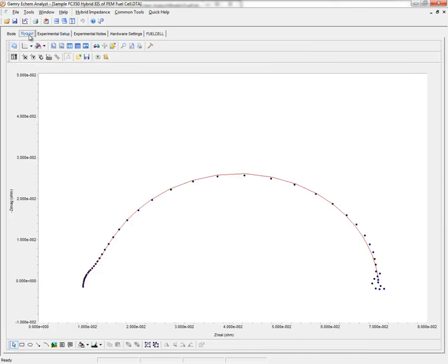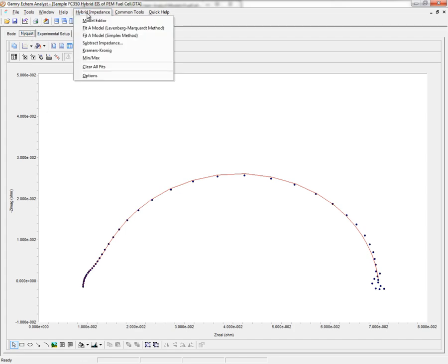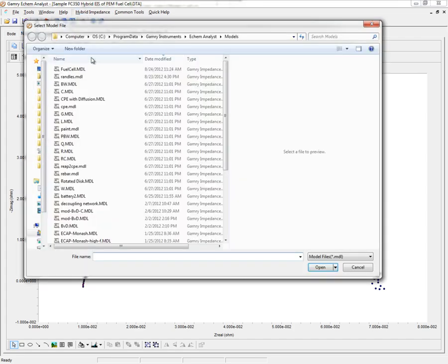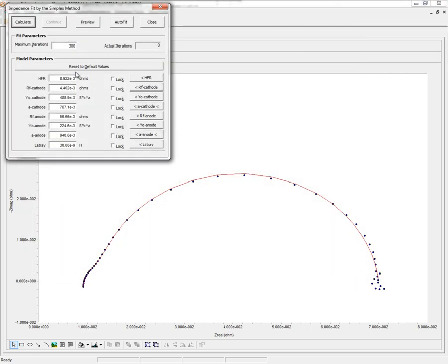Now, with the new Autofit routine, I click Hybrid Impedance, fit a model, again load up that model, and now I'm going to use the extreme case of 0 for each circuit element.